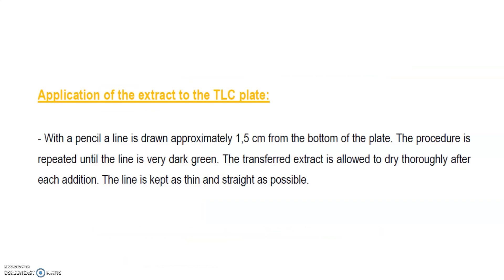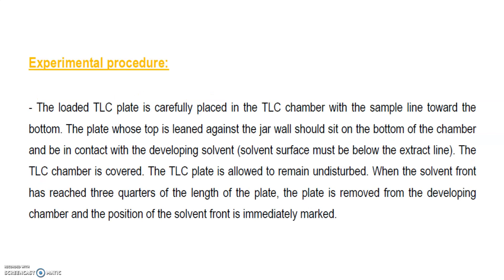With a pencil, a line is drawn approximately 1.5 cm from the bottom of the TLC plate. The extract is applied to the line and the procedure is repeated until the line is very dark green, allowing the transfer extract to dry thoroughly after each addition. The line is kept as thin and straight as possible. The loaded TLC plate is carefully placed in the TLC chamber with the sample line toward the bottom; the plate leans against the jar wall and contacts the developing solvent. The solvent surface must be below the sample line. The TLC chamber is covered and the plate is left undisturbed until the solvent front has reached three-quarters of the plate length, then the plate is removed and the solvent front position is immediately marked.